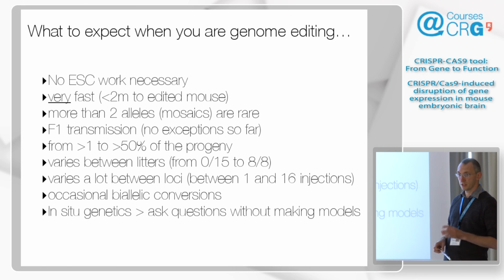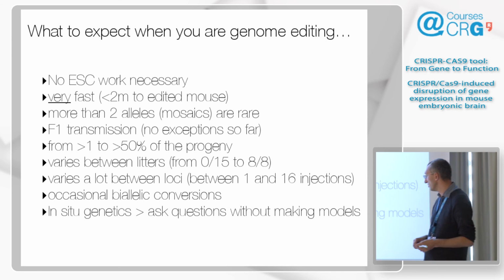Occasionally you get biallelic, but it's very rare. More likely to get a big deletion on top of what you want. So watch out for that. I covered it already.